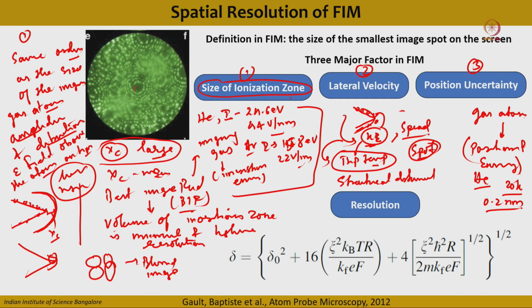So you cannot neglect the quantum nature of the imaging gas atom. Fine. So this effect will be much less in FIM than in the second class I just introduced about the FEM.